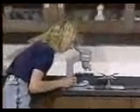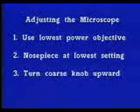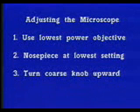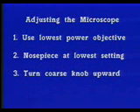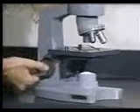Then turn the coarse adjustment knob upward to move the objective away from the slide until the specimen comes into focus. Improve the focus using the fine adjustment knob.